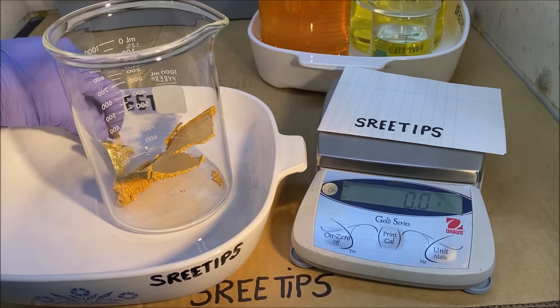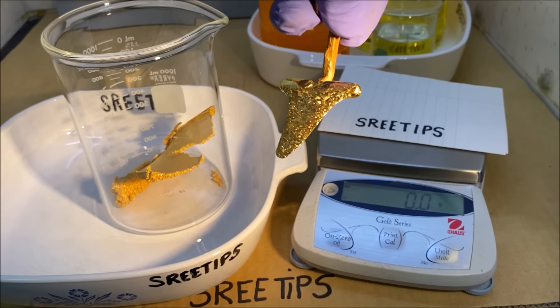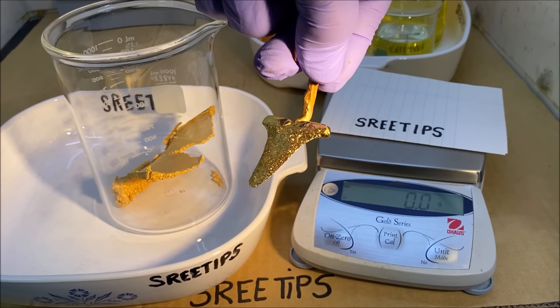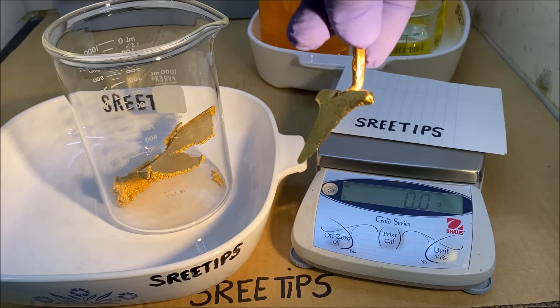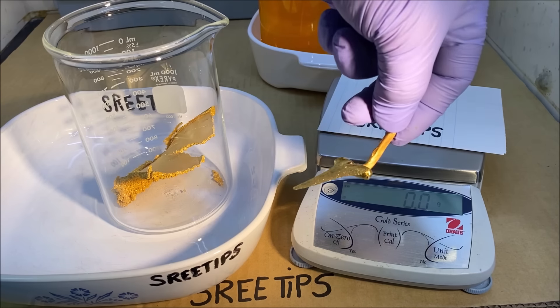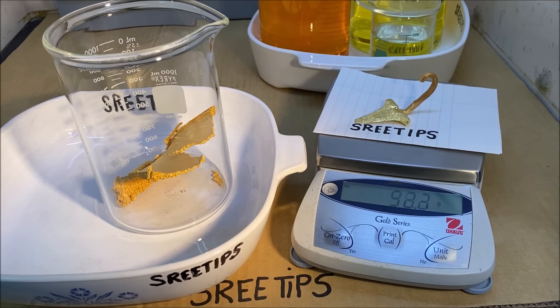Let's get a weight on this shark's tooth. If you remember from part two, this was the anode — I think it weighed 311.3 grams of pure gold before we did the electrolytic process on it. Let's see what we got for weight on this thing now. It only weighs 60.7 grams.